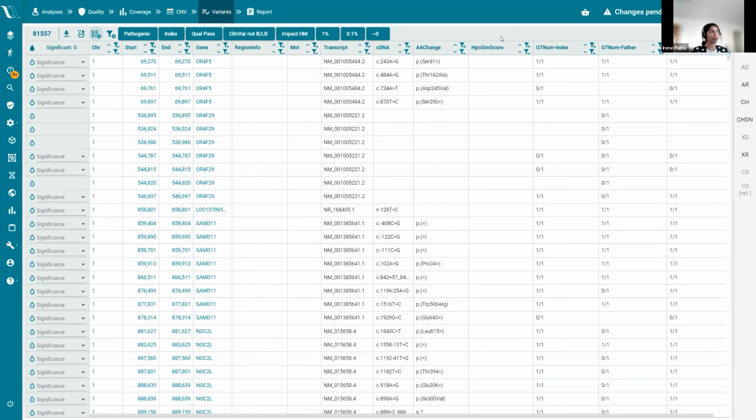Now, these configurations can be saved for oneself as the default for a particular user, or can also be shared across colleagues in the laboratory. So you can decide that as a laboratory, this is what all of us should see at least as a minimum, and then a shared configuration is possible.